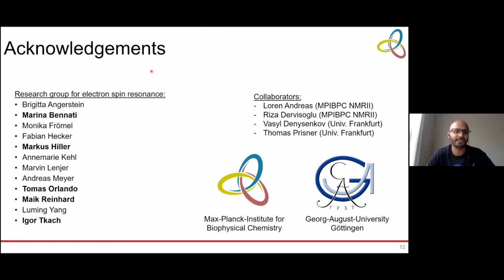Yeah, that's great. So we have a couple of questions for you, Marcel. The first one is by Elia Koprov. His question is, could the difference between polarizing and non-polarizing radicals mostly be in the electron relaxation rate? He says, the bigger the molecule, the faster the electron relaxation. Did you measure relaxation on these systems, or the saturation factor?